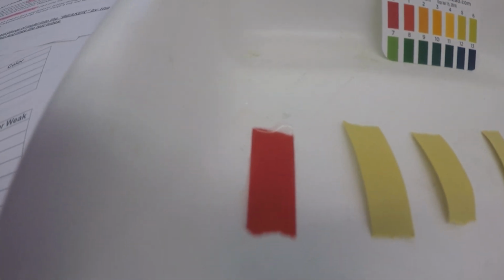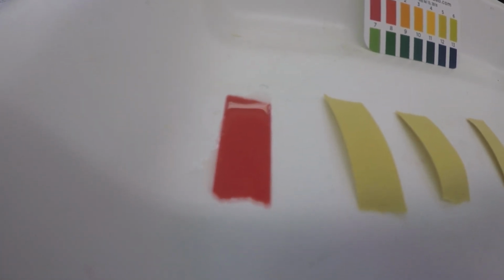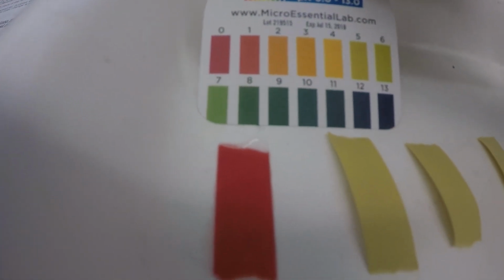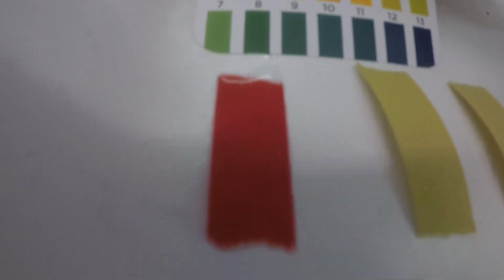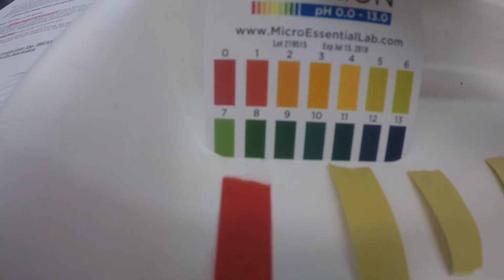First, tell me what color you think that is. Second, tell me what pH number it is according to this chart, so you need to compare that to this.